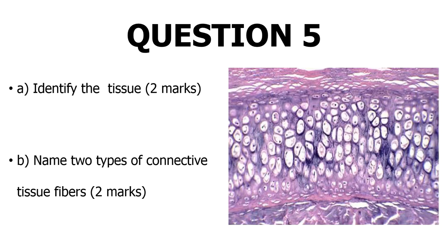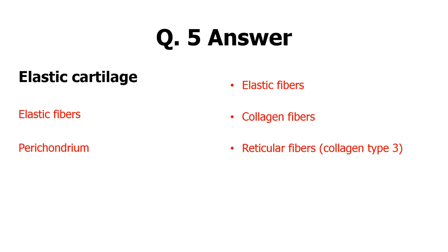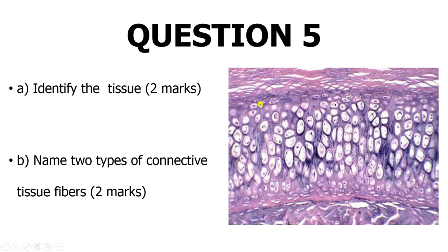You are then asked to identify this tissue, which is elastic cartilage. Connective tissue fibers include elastic fibers, collagen fibers, and reticular fibers (collagen type three). Elastic cartilage is identified by the presence of elastic fibers within the extracellular matrix and the presence of the perichondrium.